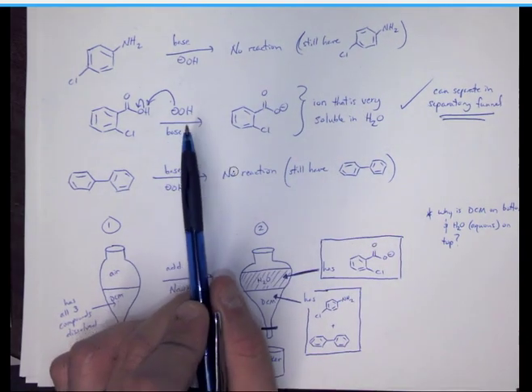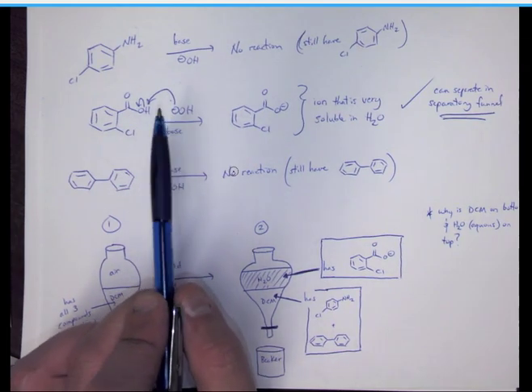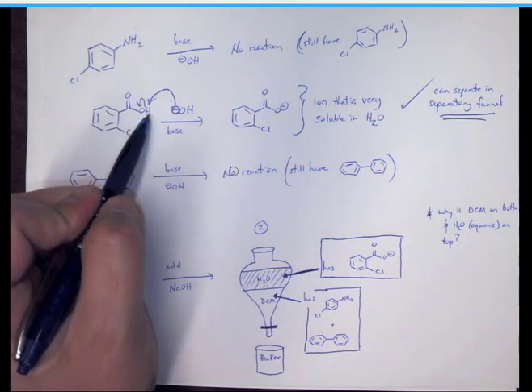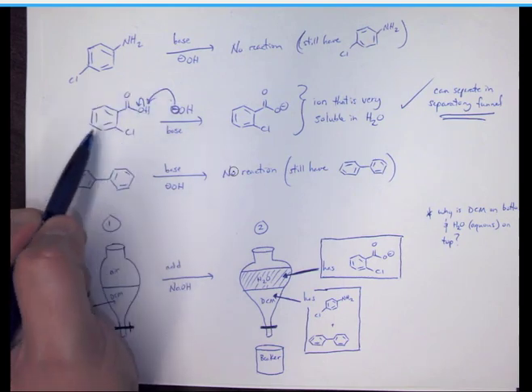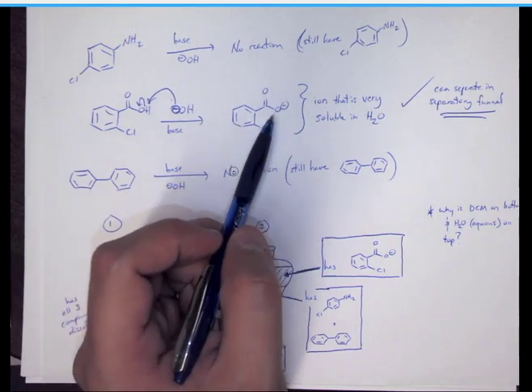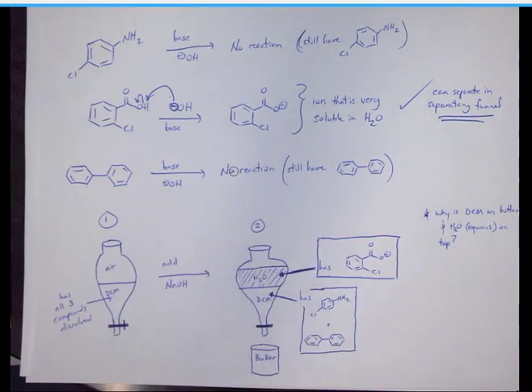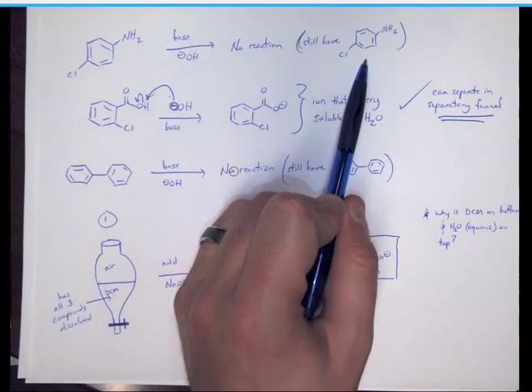However, when that base comes into contact with our acid, our carboxylic acid specifically, we can see one of the lone pairs on that hydroxide can attack this hydrogen to take it. So this acid will donate a proton, so to speak, and then we'll turn this compound into a charged ionic species like this. And as you may recall from freshman chemistry, ionic compounds are readily soluble in water. They are highly soluble. So this did nothing, stays in DCM, right?